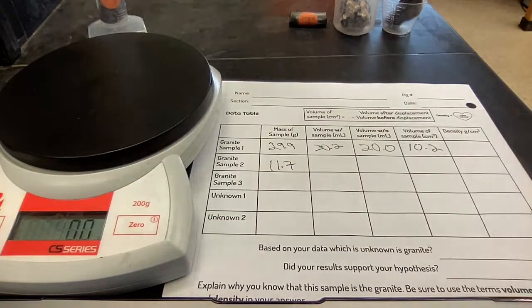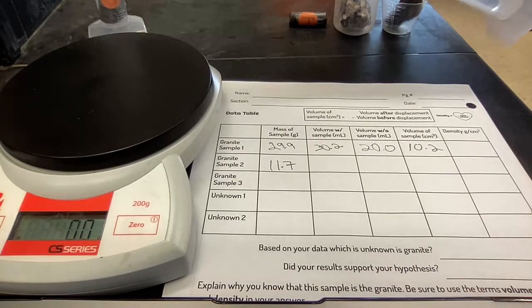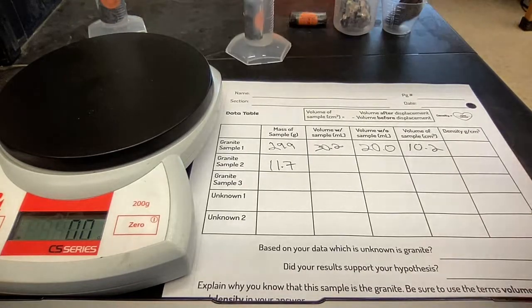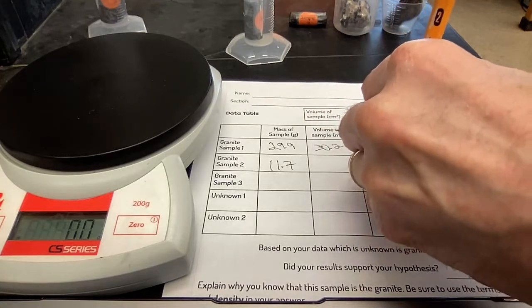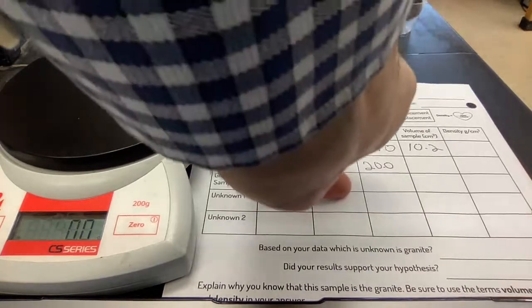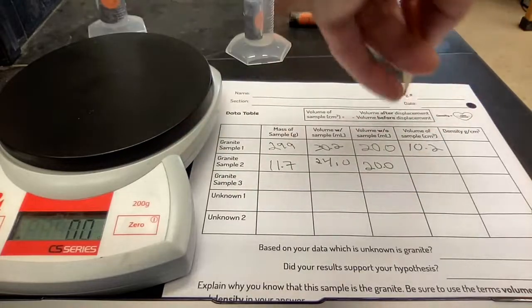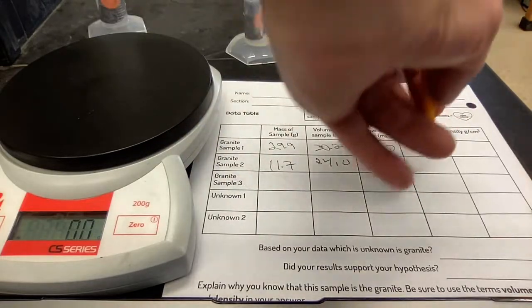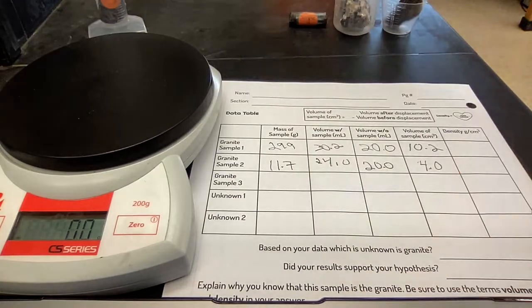grams. And we'll measure the volume of sample 2 by submerging it into 20 milliliters of water. So again, I had already determined that the water in that cylinder was exactly 20 milliliters. The combined volume of those two seems to be 24.0 milliliters. When I subtract the water's volume from the combined volume, I get 4 milliliters, 4.0.